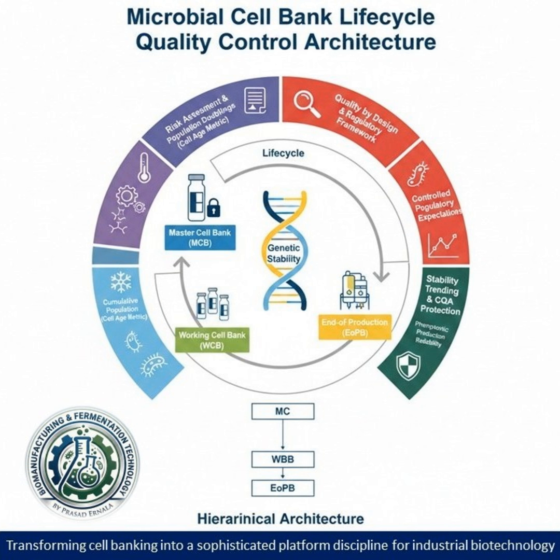This is not passive. We're diving into how cell banking is really an engineered, quality by design-driven unit operation. So it's the cornerstone. It's the cornerstone. It's designed to manage genetic, physiological, and regulatory risk across the entire life of a product, which could be 20 years. That immediately raises the stakes way beyond just simple inventory management.